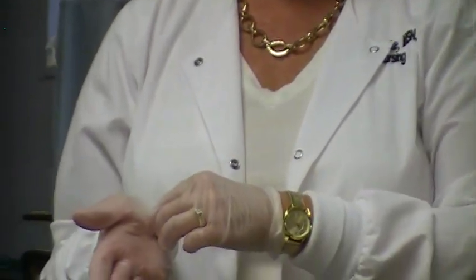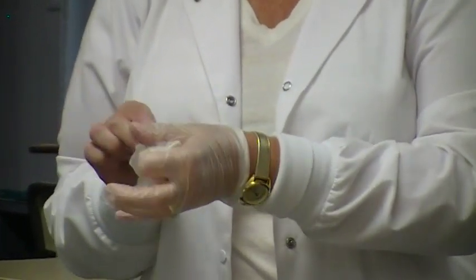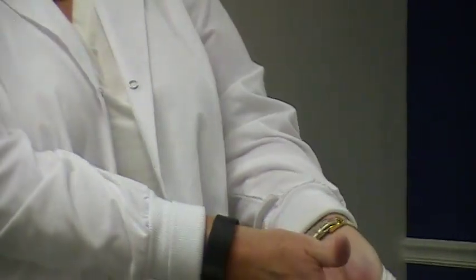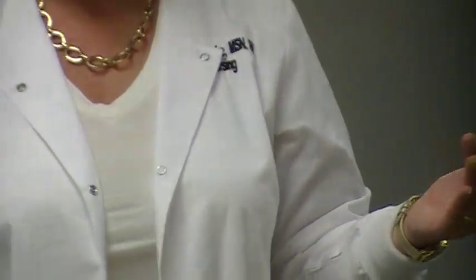So the next thing that we're going to do is we are going to go ahead and take off our gloves. When you're taking off gloves, remember that you grab it by the palm, pull it inside out as you are wadding it up into your other hand. Then you're going to slide 2 fingers into the other glove, pull down and away from you, pulling everything inside out, okay? And then we can place them in the garbage can.